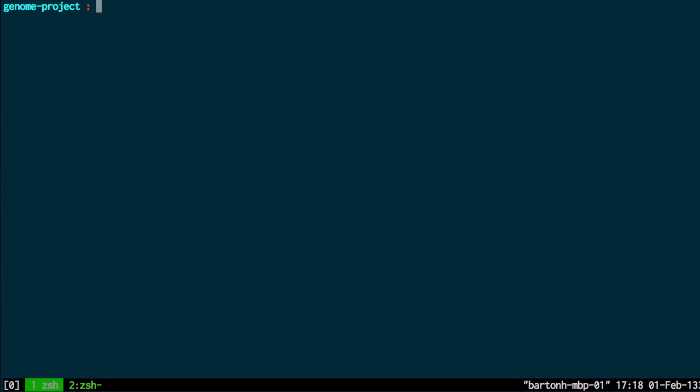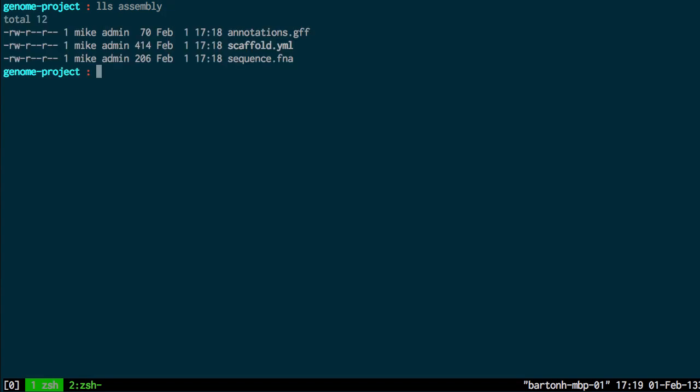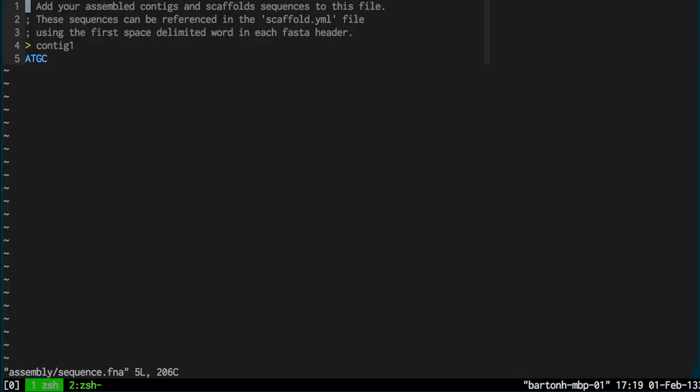So to start off with, if I show the assembly directory, this contains three files and the sequence file contains your assembled contigs and scaffolds that I assume you've previously assembled using a genome assembler and this is just a FASTA format.